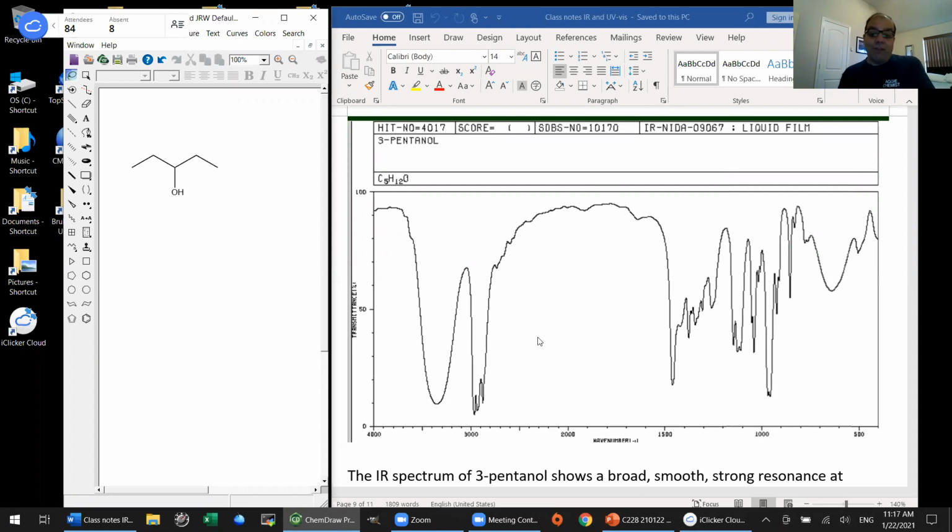Though you could probably look up both of them and see how they differ. They're probably almost identical with only very subtle differences. But certainly I would know by looking at this that I've got myself an aliphatic alcohol. There's no carbonyl or any other type of functional group besides. But alcohol functional groups jump right out at you. They always tend to look like that.